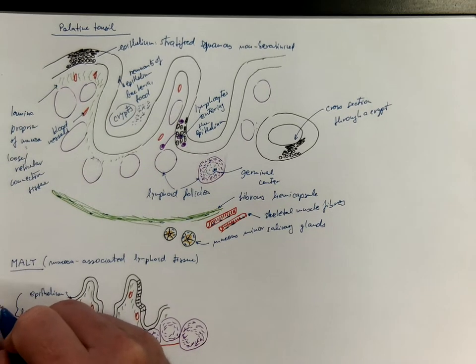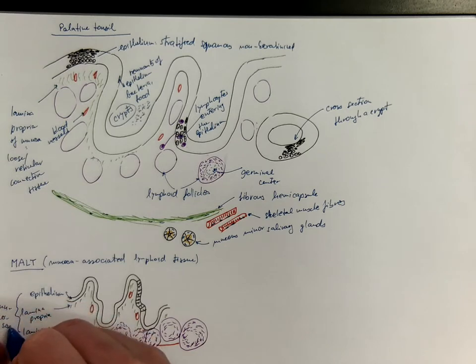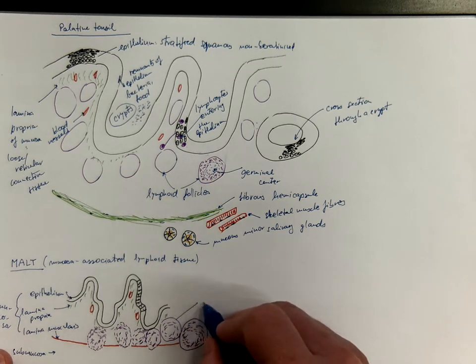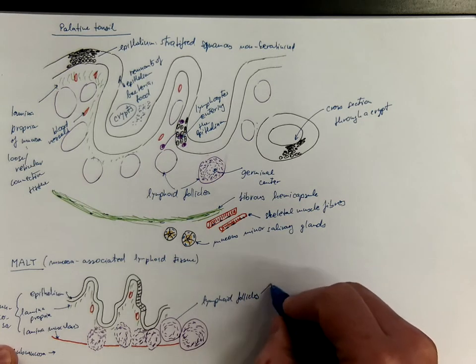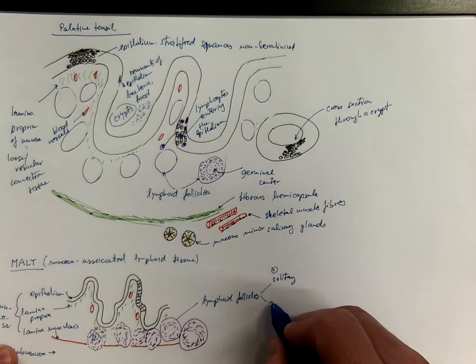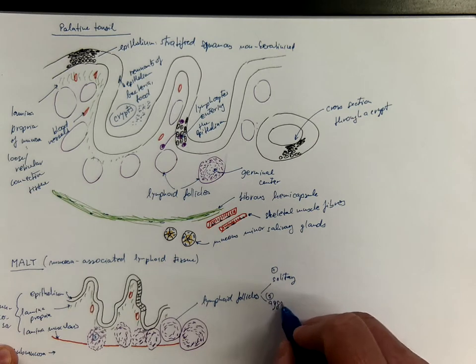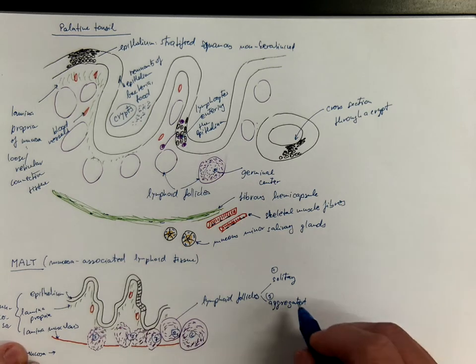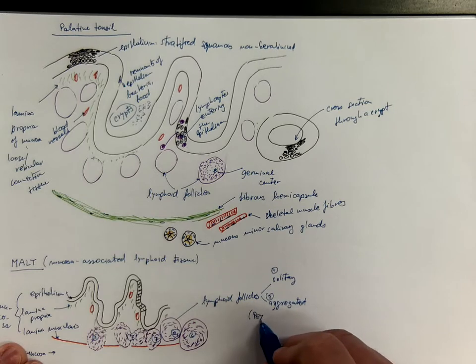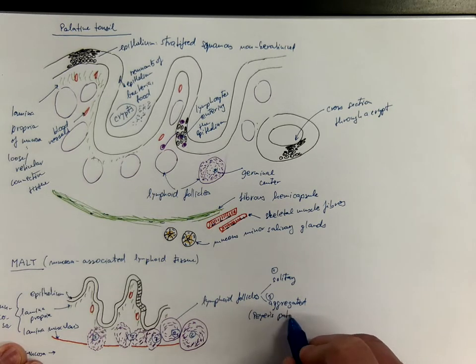All this forms a layer called mucosa and here there will be submucosa, connective tissue. But we got these lymphoid follicles that could be solitary such as this one or aggregated such as this one. A huge field filled with lymphoid follicles. And the aggregated lymphoid follicles are also known as the Peyer's patches.